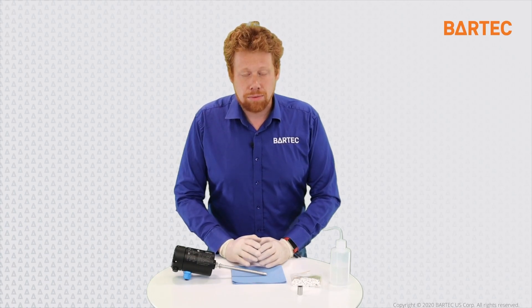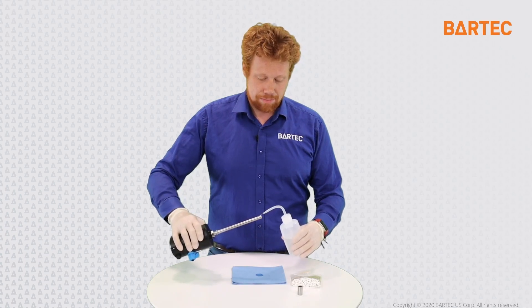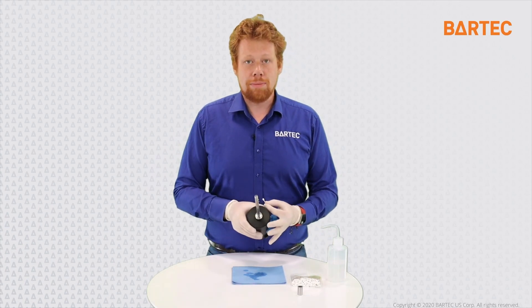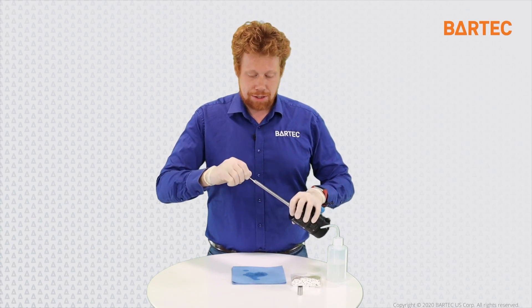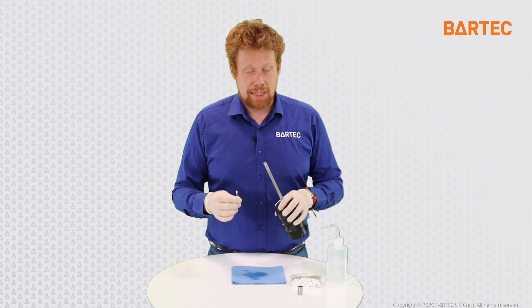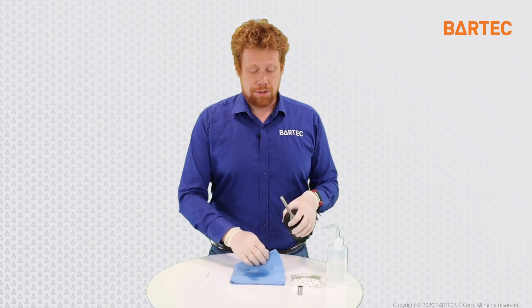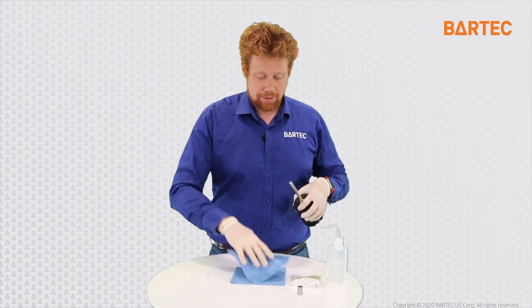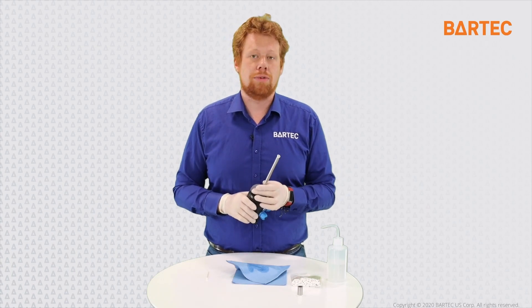How do you clean the probe? It's a relatively simple process. Once the probe is out of the process, take your IPA and wet the tip of the probe. Once the tip has been exposed to IPA, take an analyzer grade Q-tip and scrub the tip — the glass substrate of the probe — to remove any impurities or deposits that might have come in contact with the probe. Once this is done, make sure to remove any liquid, dirt, dust, particulates, or debris, and your probe is ready to go back in your process.